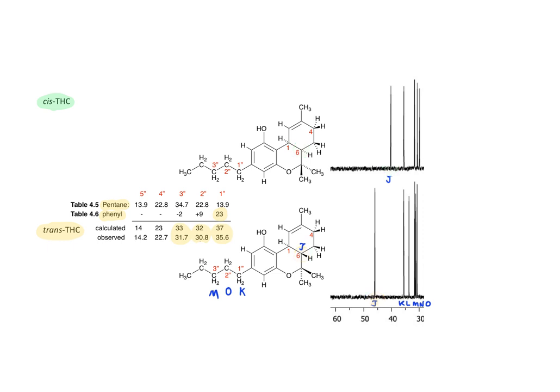It still remains to make a tentative assignment for carbons L and N, but we have two allylic carbons which are deshielded by proximity to the alkene, and with additional information from a DEPT spectrum, which is not shown here, we can assign that L is carbon 1 with the single proton attached to it, whereas carbon N is carbon 4 with 2 hydrogens attached to it.